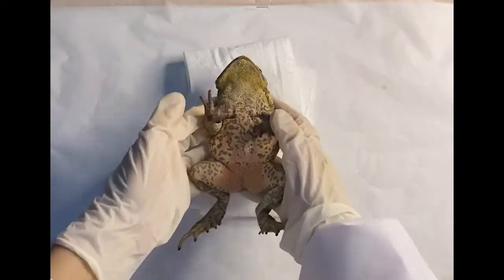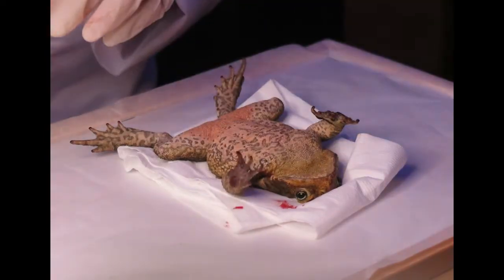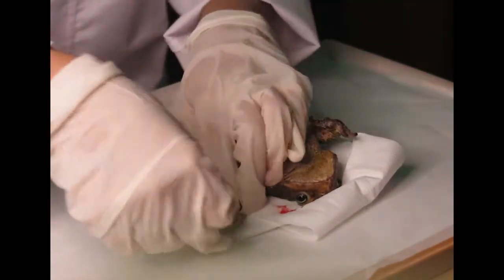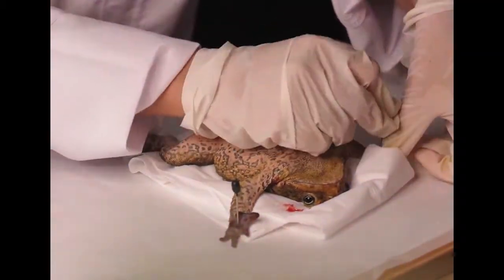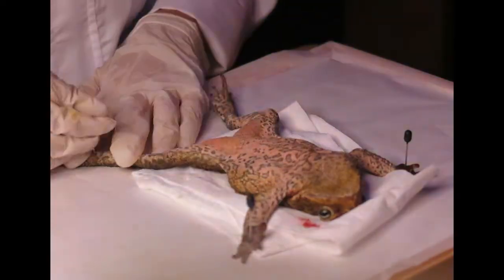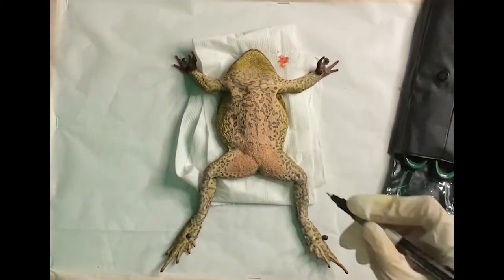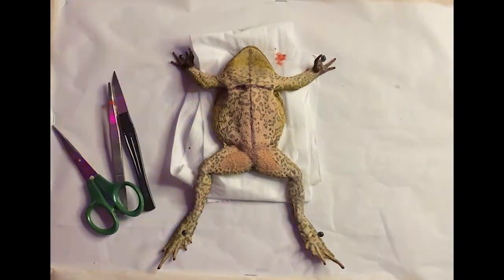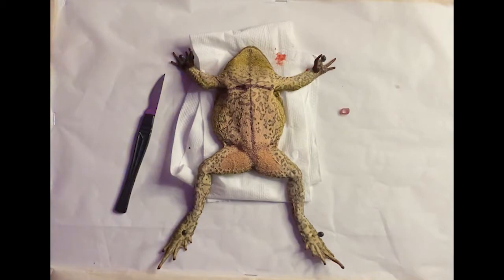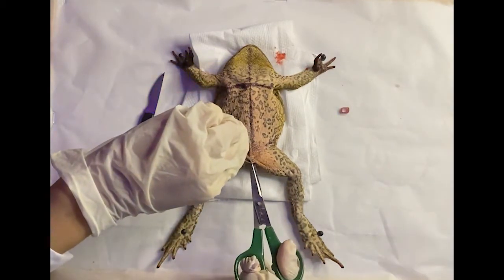Now that the frog is paralyzed, we can now pin him in a supine position onto our dissecting tray. Before dissecting him, I will be drawing incision guides on his skin. Using the forceps, I am lifting his skin on the bottom part of his body to make it easier to cut through.